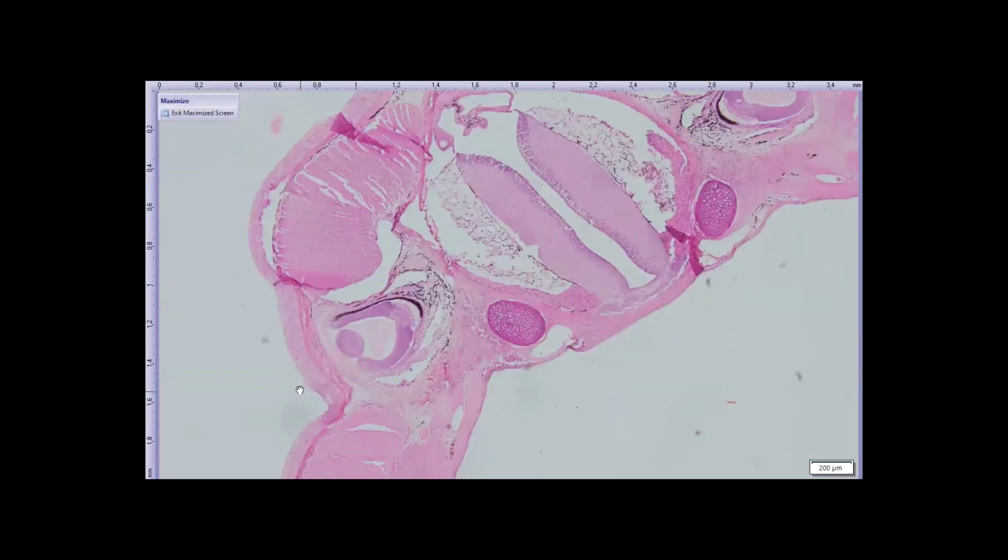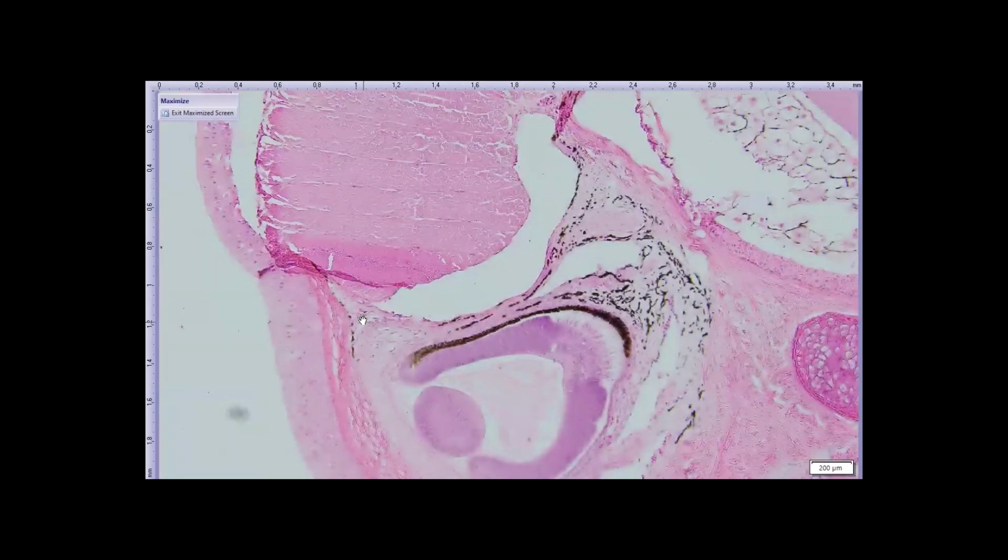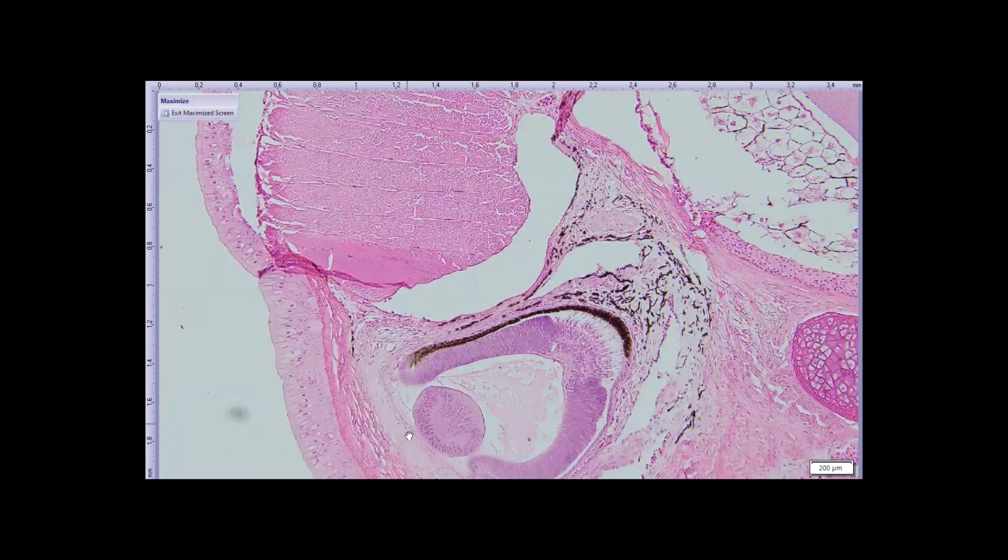Now let's have a look at that. A couple of things to notice is that they are inside the head. The integument goes over the surface. Most of the neural retina is undifferentiated. The lens also looks like an embryonic lens, with the lens fibers that go all the way from the front to the back, and it remains such. But there is an area in the central retina in the back that, for reasons that I don't understand, does become differentiated. You can recognize photoreceptors.